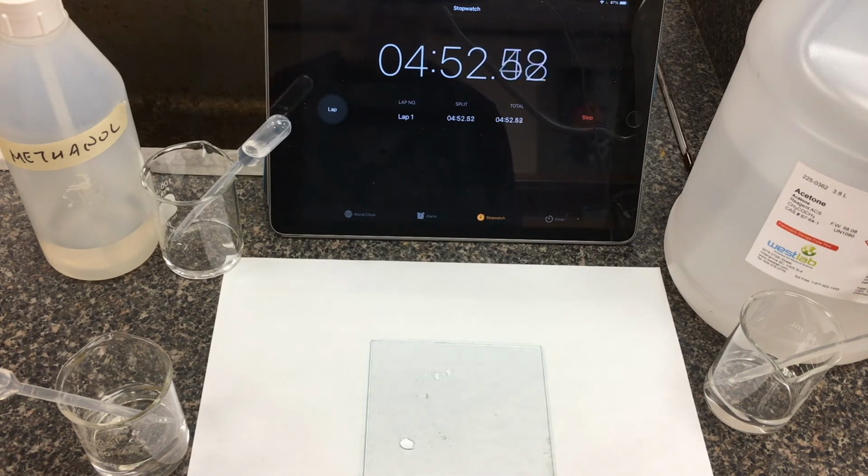Definitely a lot of the methanol had evaporated off. No real change you can see in the water droplet here. So again, we can just make a qualitative comparison.